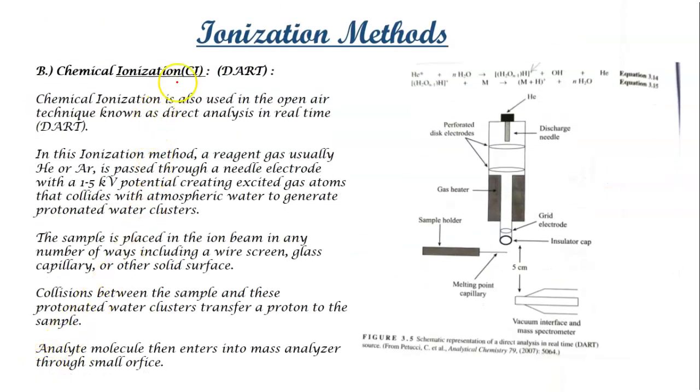And we have one more technique to discuss in this method, that is DART, the chemical ionization used in the open air technique known as direct analysis in real time. You can see the structure over here. A reagent gas, usually helium or argon, is passed through a needle electrode with 1 to 5 kilovolt potential.